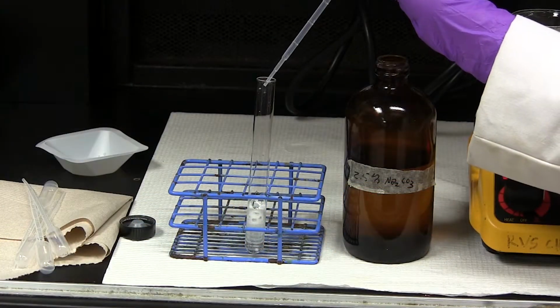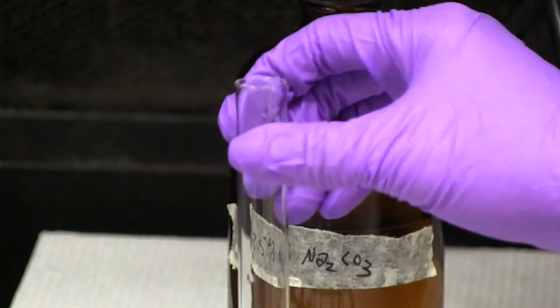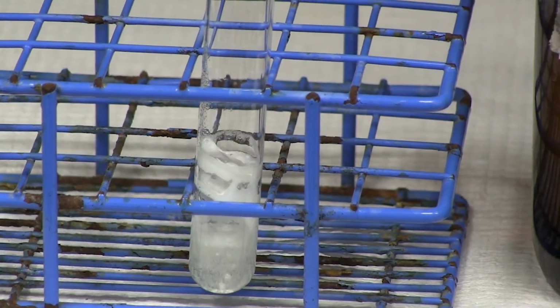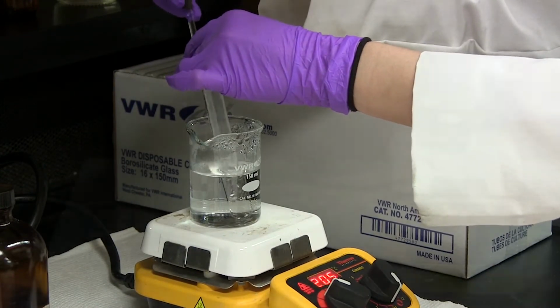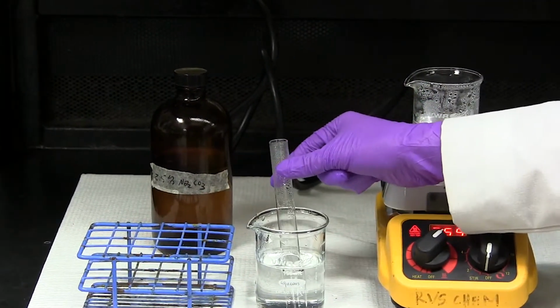Next, carefully add 5 milliliters of a 2.5% solution of sodium carbonate. This addition should occur carefully with plenty of mixing. CO2 will evolve, and care must be taken to ensure the mixture does not bubble out of the test tube. Place the test tube in boiling water and mix until dissolved. Cool the test tube and its contents to room temperature by placing it in a tap water bath.